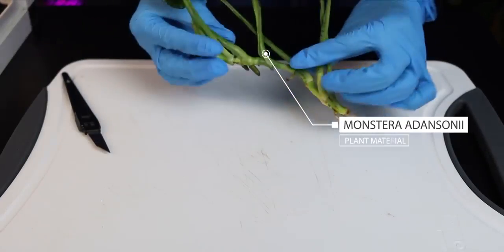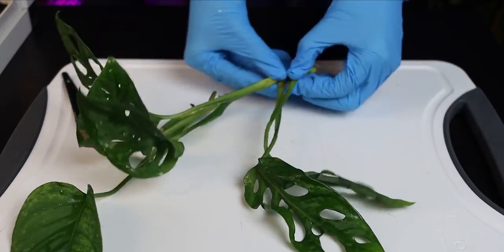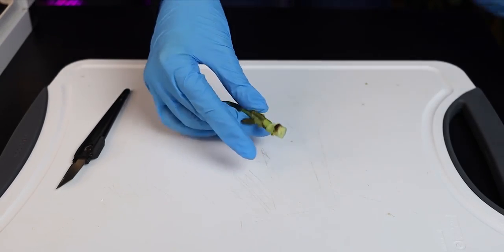Okay, onto the plant material. In order to prep this plant for tissue culture, we need to clean and remove any debris from the plant. We only need the nodes in this case, so here I'm removing the leaves to help reduce any risk of contamination.